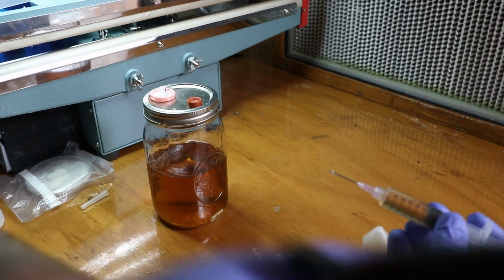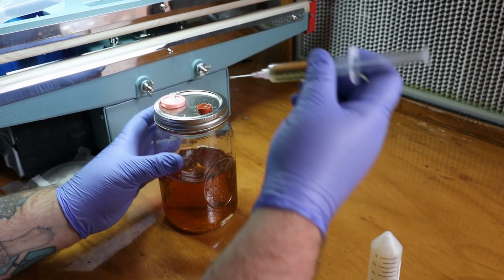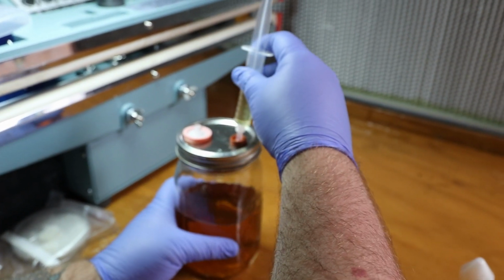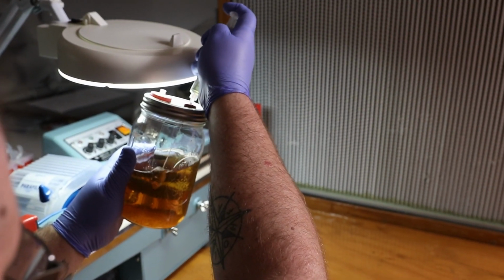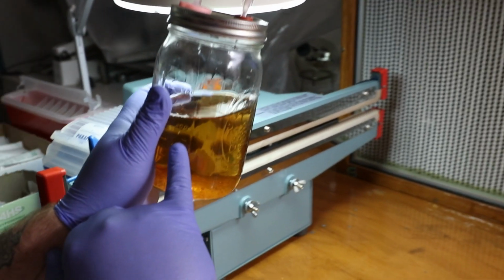After this, I'm going to lubricate that injector port one more time. This just helps the needle slide in and out. And this is where we stab. And then we're just going to depress the plunger on the syringe. There's going to be a lot of pressure. You're going to have to push to get it. And you see, once I get that pressure, it just takes a tiny little bit. You'll see here.